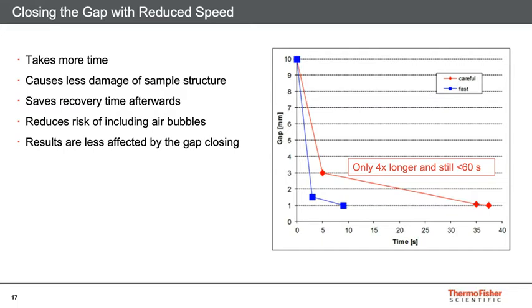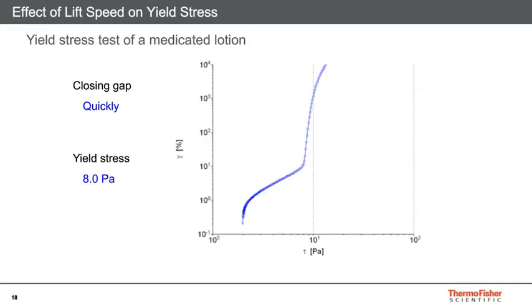So on the next slide, we actually have some example data. This is measuring the yield stress of a lotion sample. We're measuring the deformation on the y-axis as a function of input stress. So applying stress, initially the material is just deforming linearly as we're just stretching that material. And eventually we get to a critical point where we're stretching the material so much that essentially its structure breaks down, and it goes from deforming linearly to that structure being broken down, and it basically deforms exponentially.